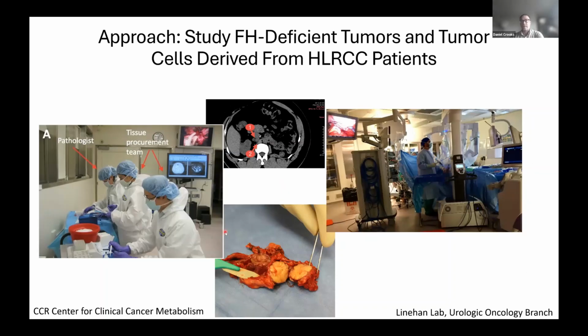But it turns out, as anyone who does EM knows, that organelles can also change during ischemia. So a tissue that comes out and then sits in the OR waiting to go to the frozen room to be processed by pathology for an hour or two, or even worse, sits in the body without a blood supply until the end of the surgery because it's a robotic surgery, the mitochondria are not going to look the way they did when the thing was perfused well with blood and oxygen.